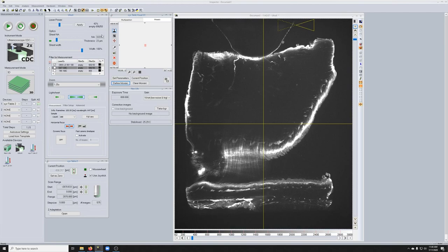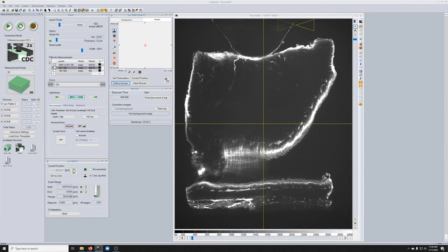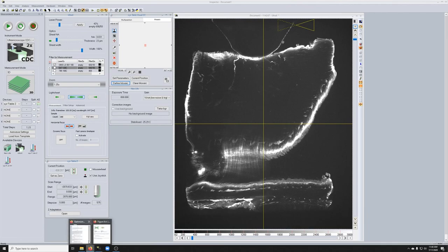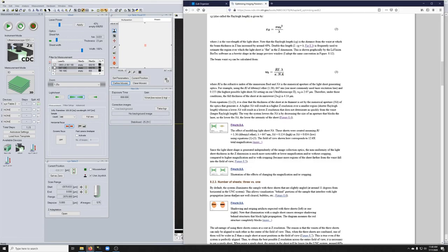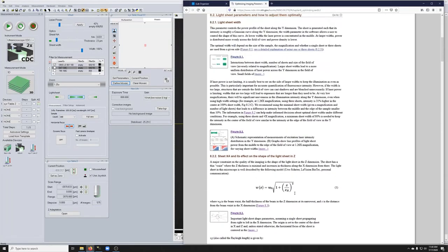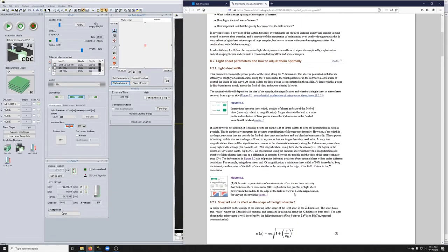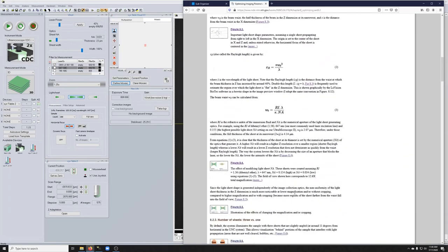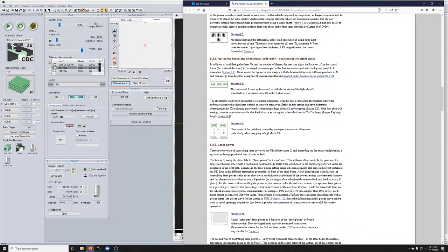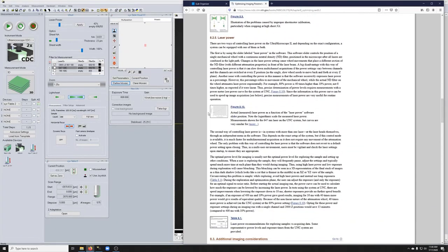This is something that's very confusing about this instrument, but when you change this, this is not the percent laser power, even though it says percent and it's in a box that says laser power. This is percent of movement of an optical component that changes the laser power non-linearly, according to a relationship that is pasted on the wall of this room, and that's also in my light sheet guide. Let's see if I can find it here. Here we go.